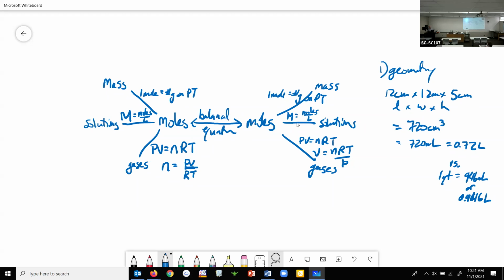As opposed to the vinegar, that's where our experiment within an experiment comes in. We've got to figure out what the concentration of the vinegar is. In other words, what we're told on the label is that it's 5% vinegar by volume. We're not being told how many particles of vinegar are present. And that's what we really need. So we'll have to do a little experiment with an experiment to figure out what the molarity is so we can relate the number of particles to the volume for the vinegar. So we're using the mole map to get from the carbon dioxide to the baking soda, from the carbon dioxide to the vinegar.